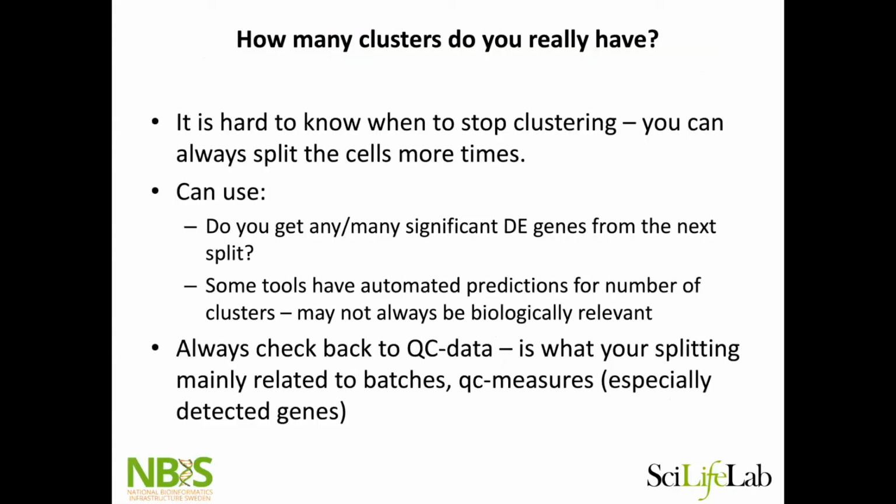But then we come to another very important question. How many clusters do you really have in your data? You can increase resolution, or you can cut your dendrogram as low as possible, but there's no real answer to how many clusters you have in your data set. It really takes knowing the biology of that data to make some reasonable decisions.